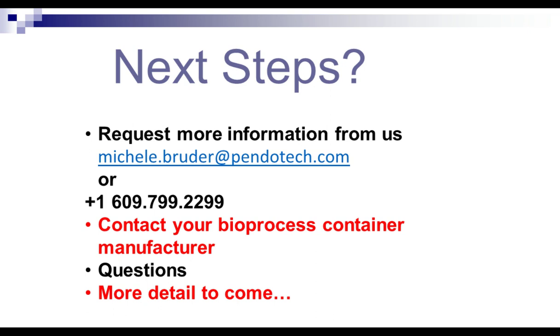Okay. And can we use the same PMAT as for the pressure measurement? The short answer is yes. It takes the same connection. It's really recommended for this application that a high resolution pressure mat is used so that you get down to that third decimal place accuracy.